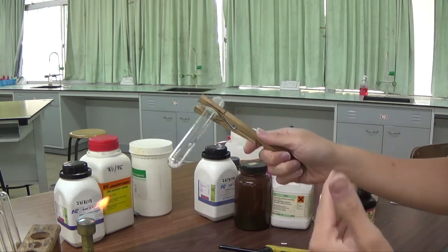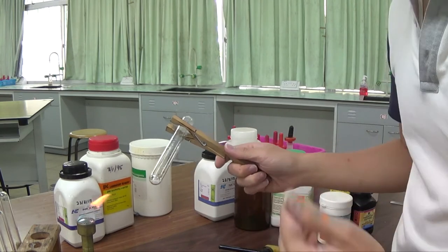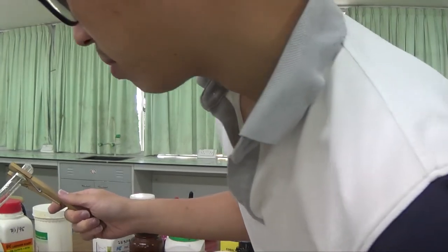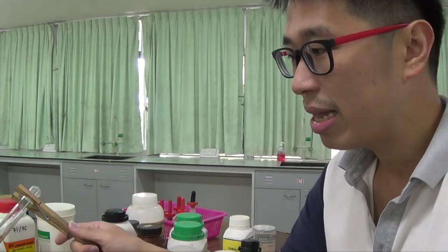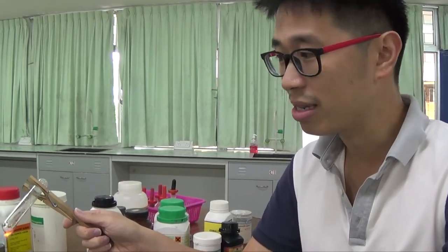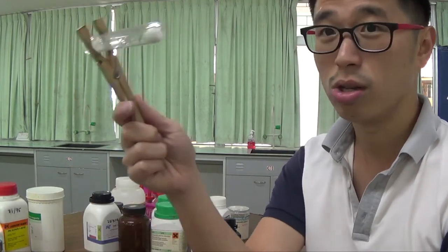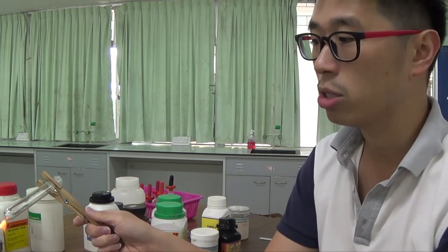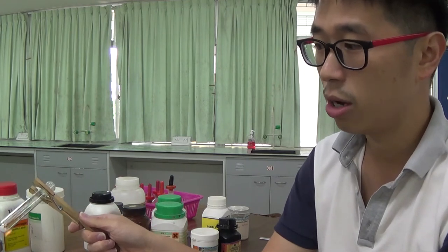So usually if you want to do a gravimetric analysis, that has to do with mass calculations. Mass calculations means you need to be exact, so we don't do it in a test tube. We'll have a proper crucible where we heat until we have constant mass. And I will share that in another tutorial video sometime in the near future if I have the opportunity.